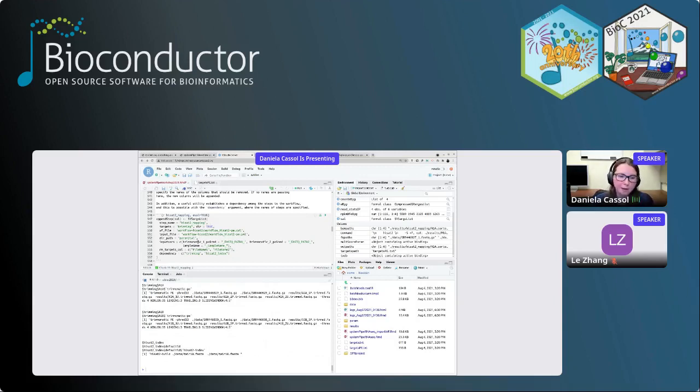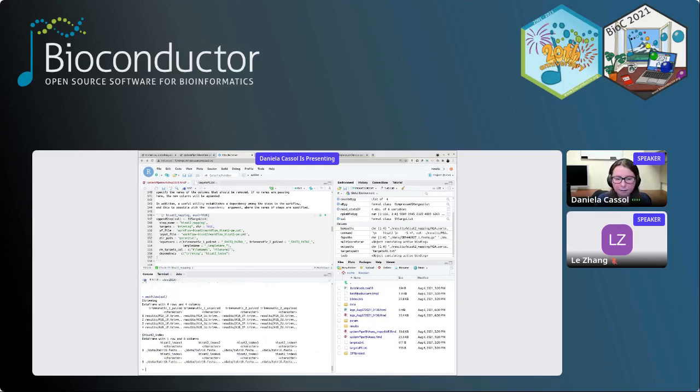So I pass here the name of that particular step, and then we need to inform which one of the out files we want to use. And for that, we can examine the out files. Here, let me print that. So then you can see here we have the trimming, and then we have this first database where we are expecting 4 files for each one of the samples. So the first one is the trimmomatic one paired, and the ones we want to use is the trimmomatic one pair in the third column, also the trimmomatic two paired.